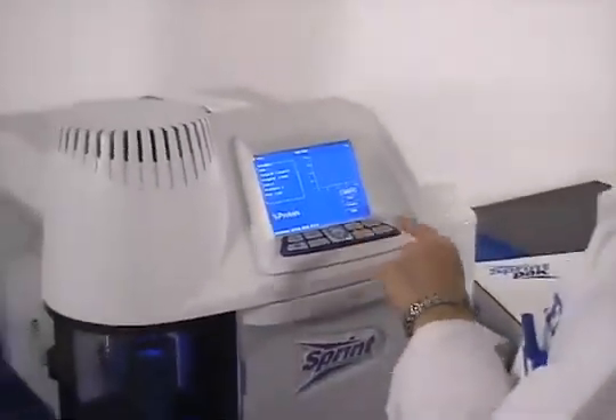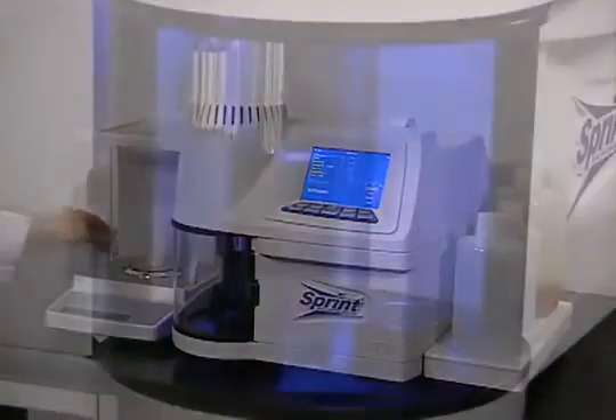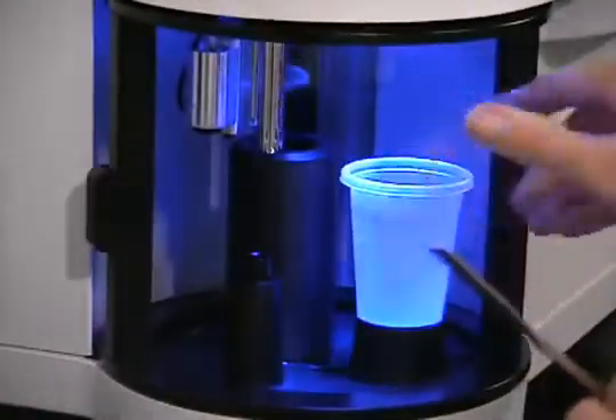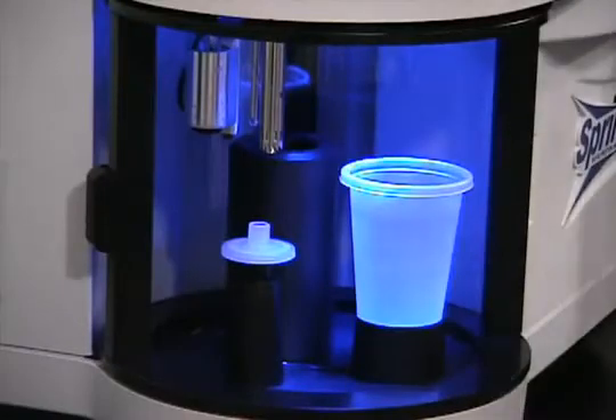With its incredibly rapid two-minute test time, Sprint measures true protein, not nitrogen. Producers can test raw materials, work in progress and finished products with the confidence of an AOAC and AACC approved method.